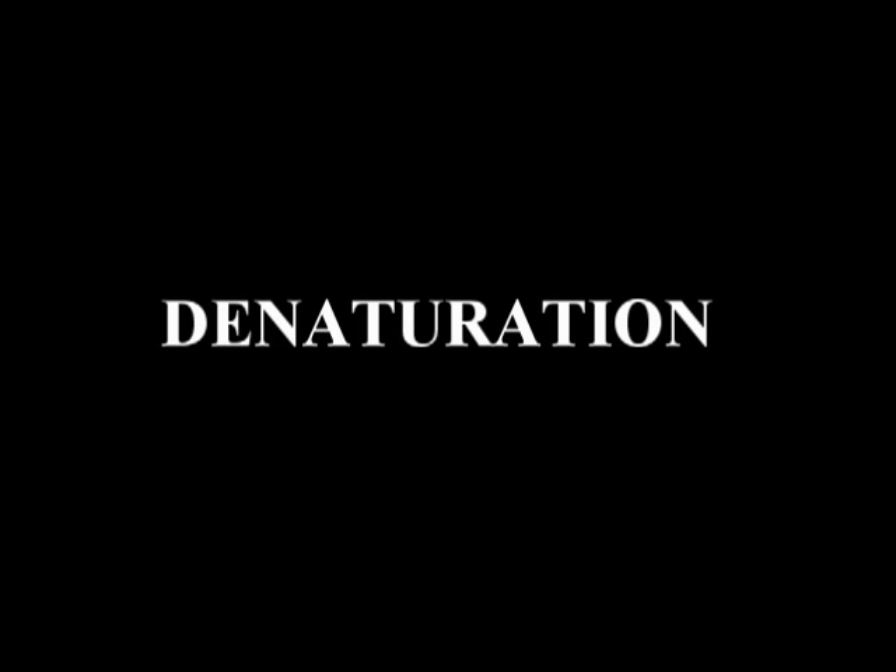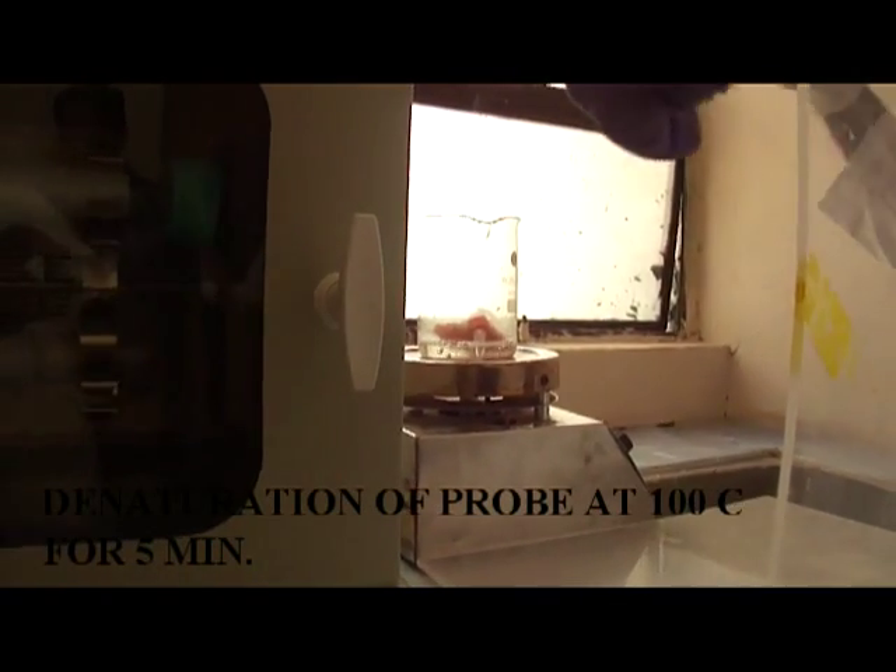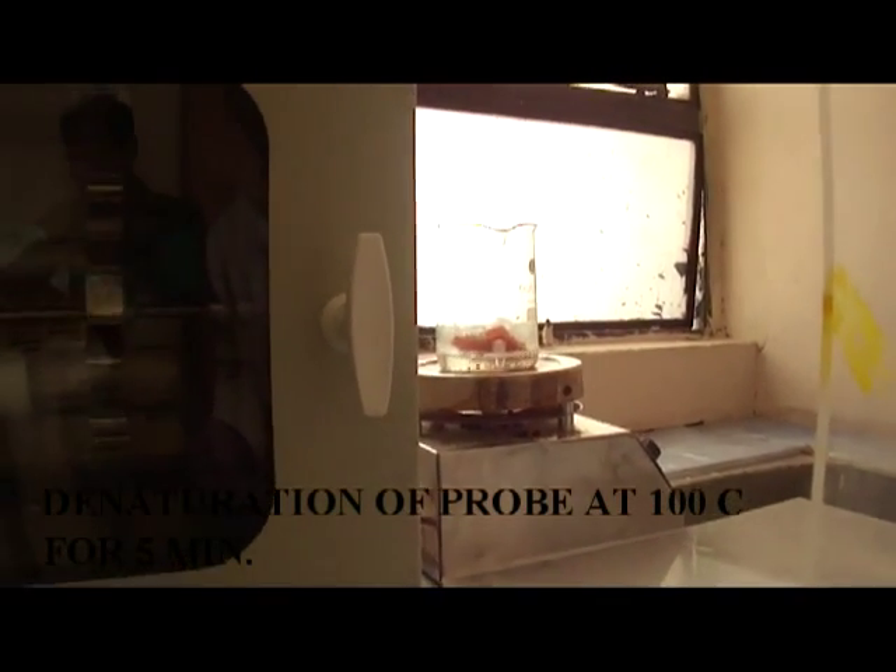Then for denaturation, denature the probe by incubating at 95 to 100 degrees Celsius temperature for five to seven minutes.